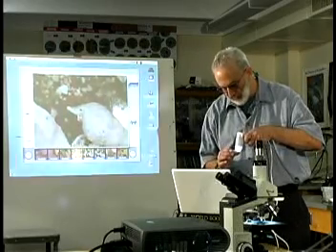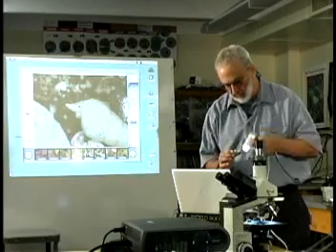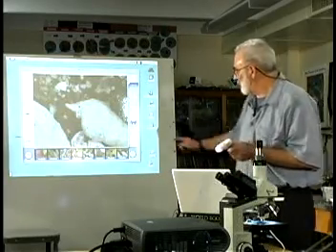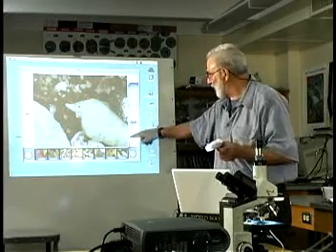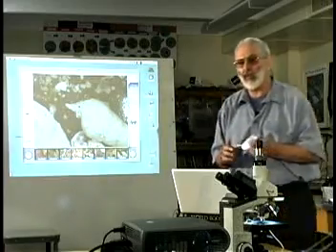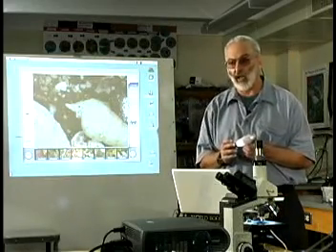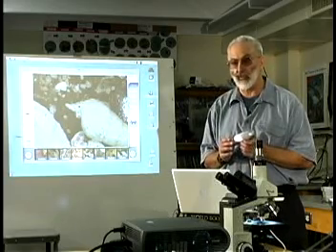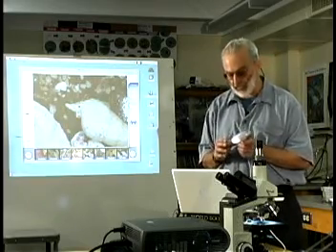Also in this area we're going to look at some marine sediments, and I think I can get some nice shells in here. And there we go. So let's look at this sample. And as you can see, there's a nice huge shell sample here. There's another shell sample there and one down in there. And again, when we look with a higher power lens, we'll be able to tell exactly what types of shell these are and what organisms they come from.